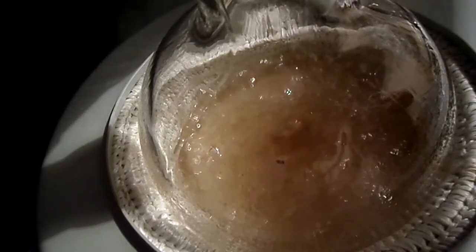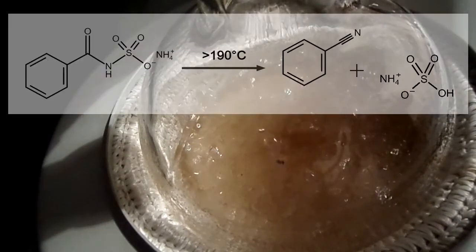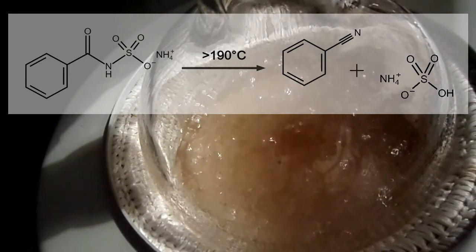At temperatures above 190 degrees Celsius, the second part of the reaction occurs where our ammonium N-benzoyl sulfamate intermediate decomposes into ammonium bisulfate and our product, benzonitrile, which we can see is boiling in the flask.